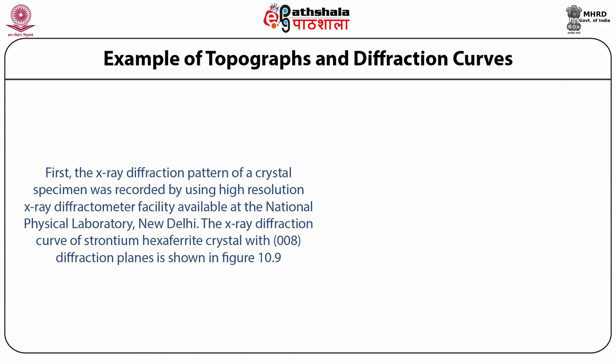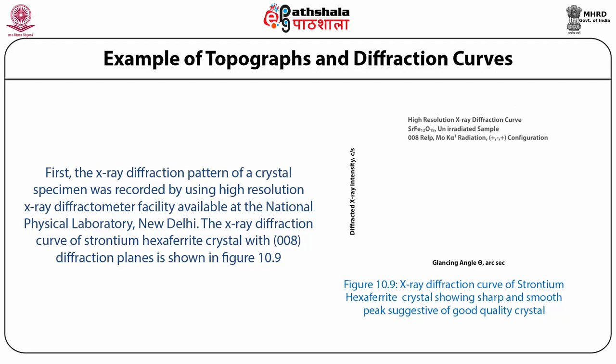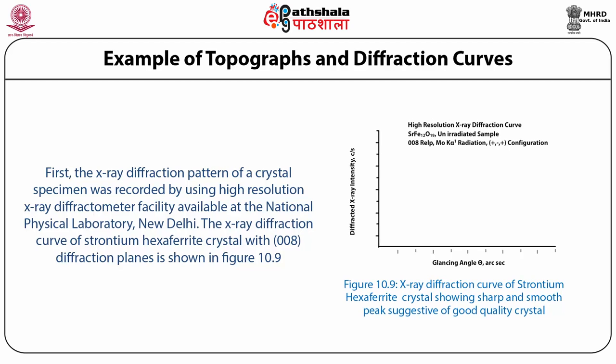First, the X-ray diffraction pattern of a crystal specimen was recorded by using high-resolution X-ray diffractometer facility available at the National Physical Laboratory, New Delhi. The X-ray diffraction curve of strontium hexaferrite crystal with 0.0.8 diffraction planes is shown in Figure 10.9, showing sharp and smooth peak suggestive of good quality crystal.